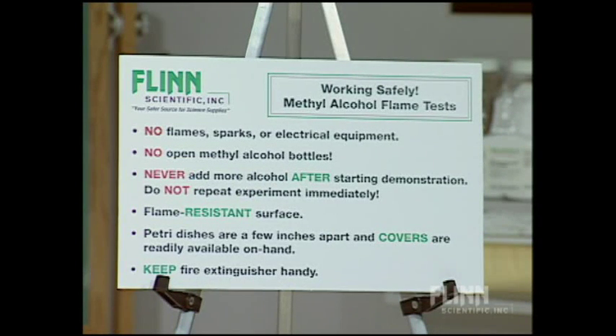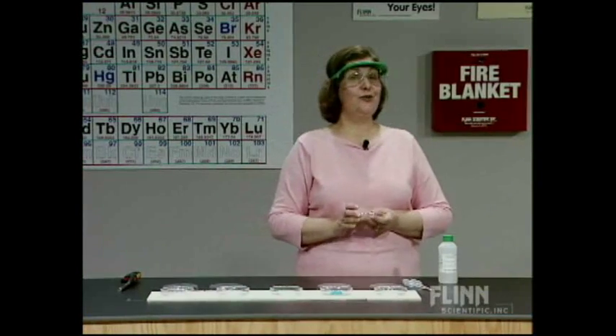Working safely with methyl alcohol - first of all, as we're setting up: no flames, no sparks or electrical equipment. We've removed all flammable materials from the surface. No open methyl alcohol bottles once you start the demonstration. We're going to add the methyl alcohol to our petri dishes, then cap it and take it far away from the demonstration. Once you start the methyl alcohol flame test, you never add more alcohol after starting - not ever. When accidents occur, it's always because the flames flash back into the methyl alcohol bottle. We have a flame-resistant surface and ceramic pads under each borosilicate petri dish.